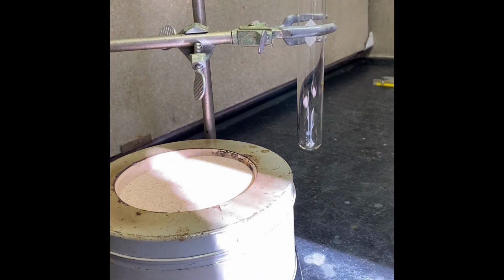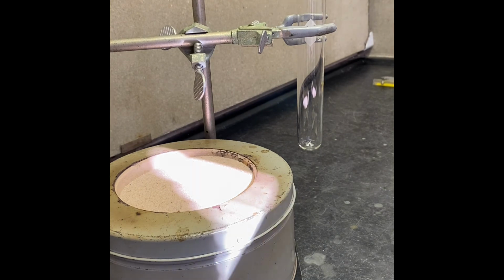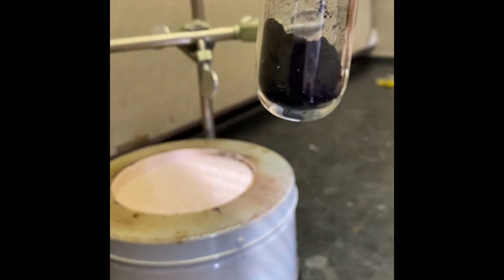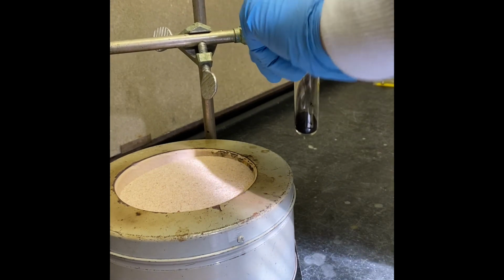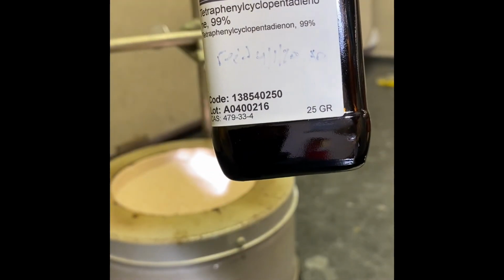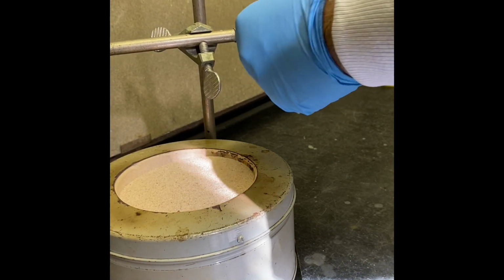Now I'm gonna transfer our compound to the reaction flask and then we're gonna start our reaction. So we transferred our solid here, one of the reagent, which is tetraphenylcyclopentadienone. That's the one. We got 2 grams of that compound, and now it's in the test tube.